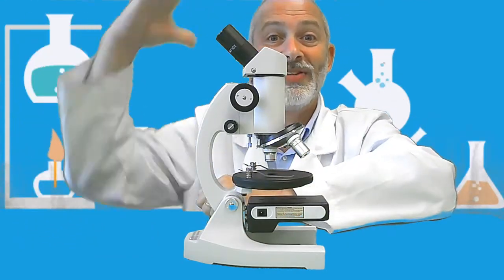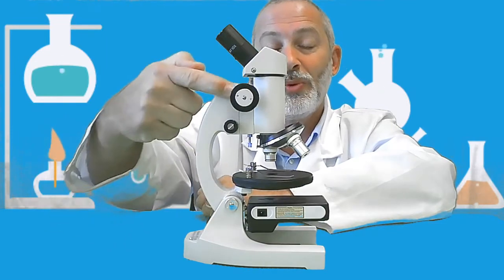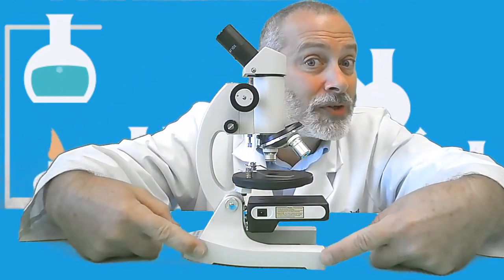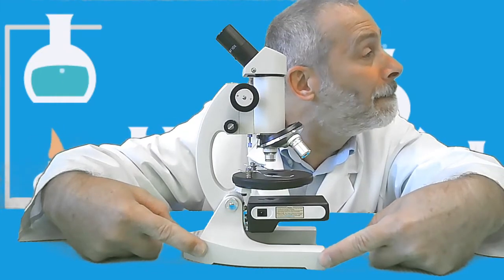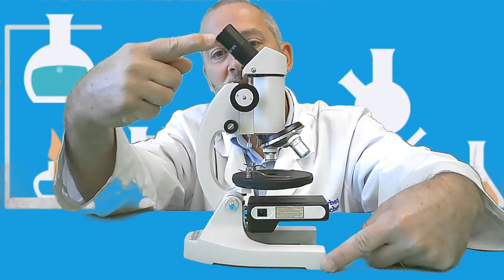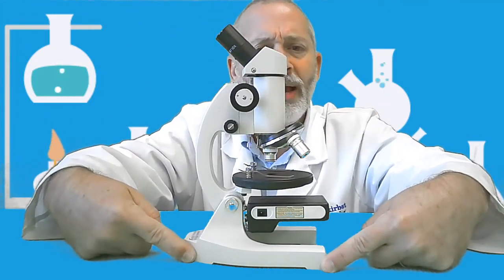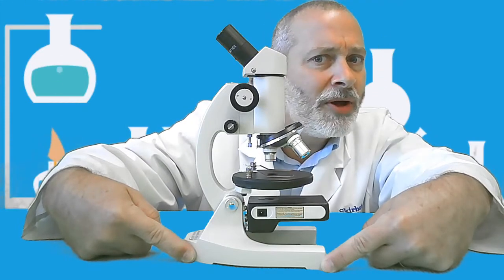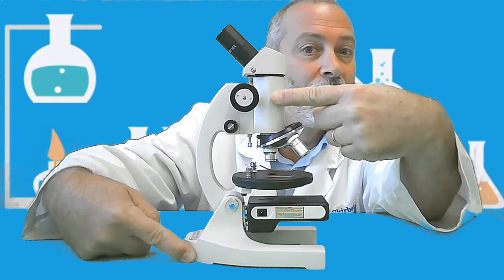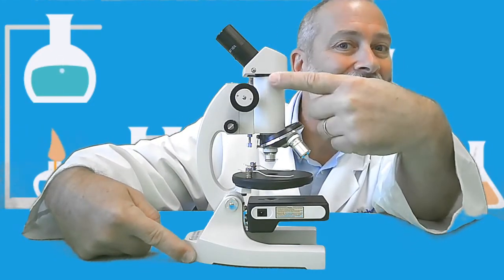Nice. It is our arm. The arm connects the top with the bottom. In fact, let's go there now. What is the bottom of the microscope called? Base. Fantastic. So we've got the eyepiece lens, the arm, and the base. All right, let's look at some other parts. How about this tube right here? What is that called? The body tube.